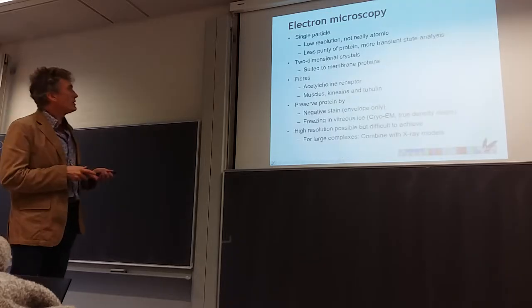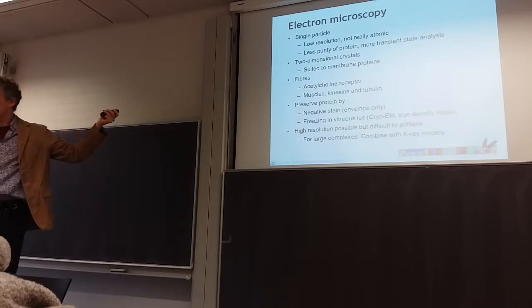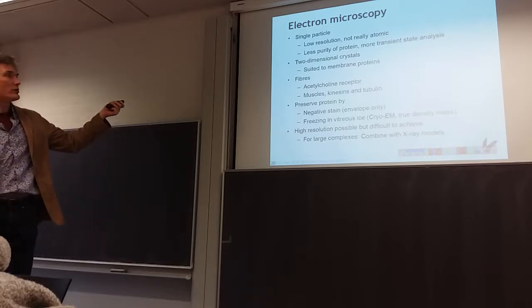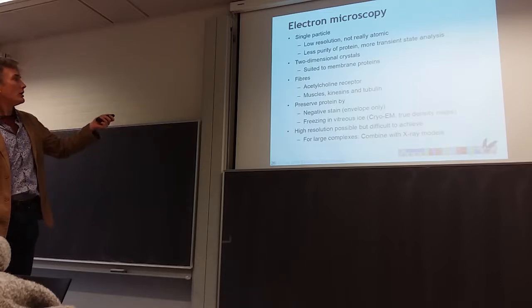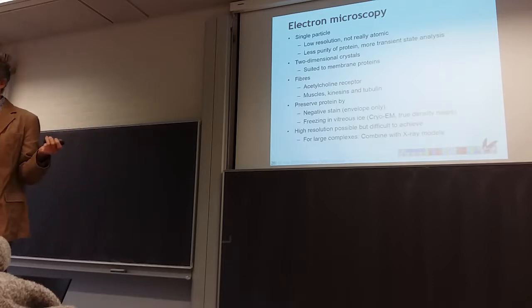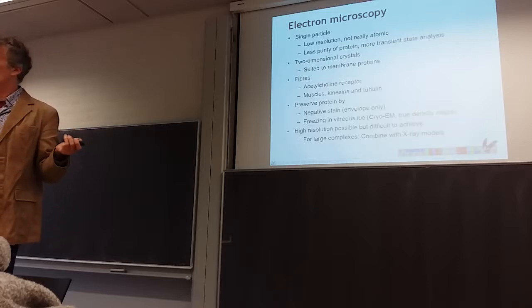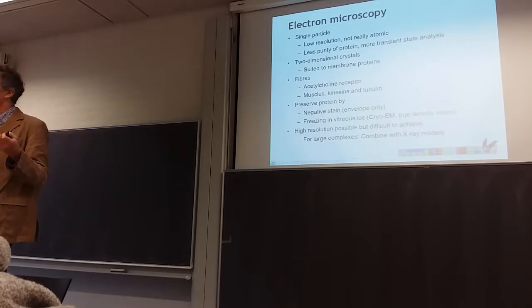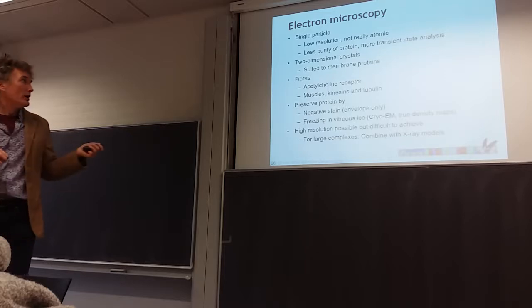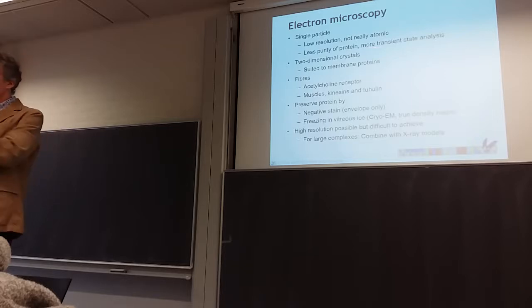So one of the cool things that you can do with EM is single particle work. Because it's microscopy, you can only zoom in, and you can look at individual molecules. It's static in the sense that because it's cryo, you've frozen your sample. It's not crystal water, it's not ice, it's amorphous water. That's important because once ice crystals form, it distorts everything. So you don't really have to purify anything. As long as you can locate the thing that you're interested in, then you can just zoom in on it.